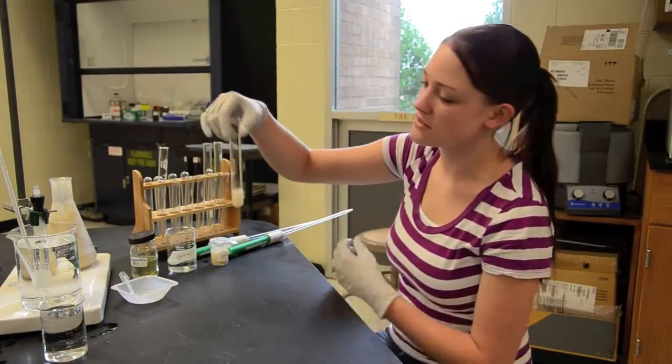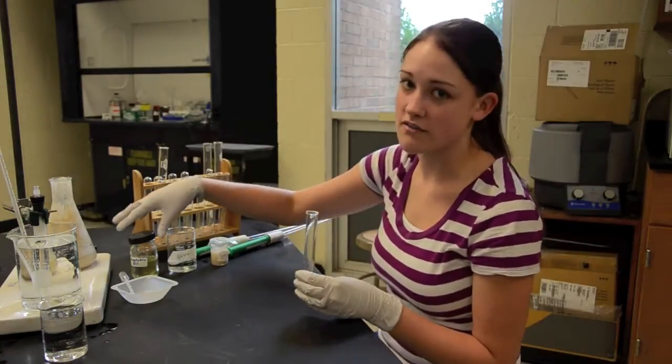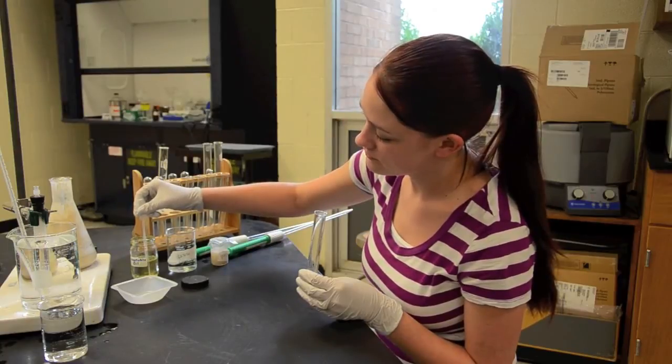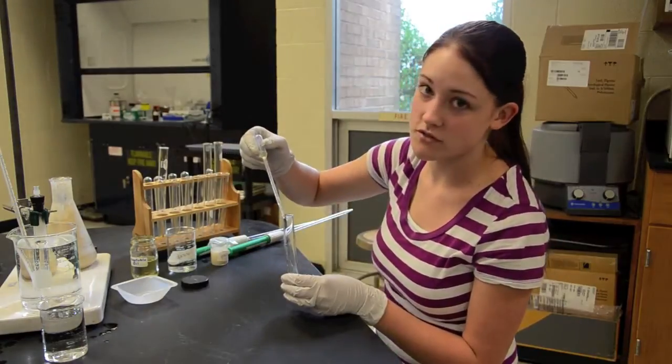We're going to gently swirl to make sure it gets all mixed up. Then, to ensure that you have an anaerobic environment, you're going to add a coating of vegetable oil. This prevents any air from getting down to the yeast, so they're forced to do fermentation.